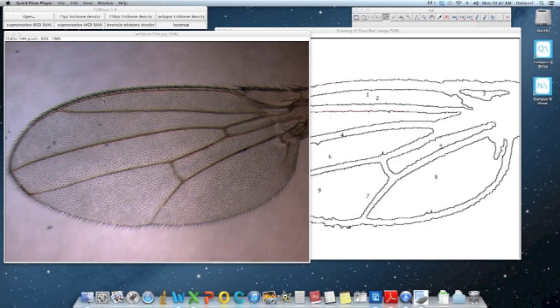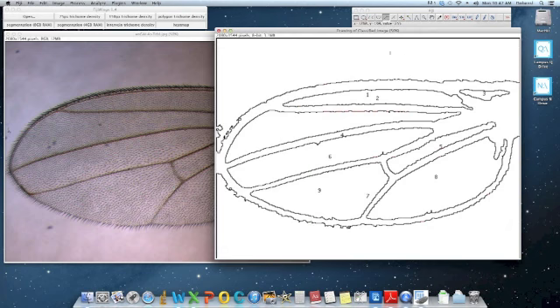When segmentation analysis is complete, you've got the wing file and an image called Drawing of Classified Image, which outlines the wing veins and the intervein regions. Now, the intervein regions can be treated in one of two ways. By clicking on Intervein Trichome Density, you can select an intervein region and it will count the corresponding trichomes and trichome density in that region, thusly.